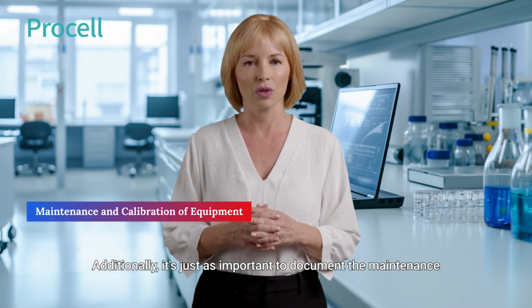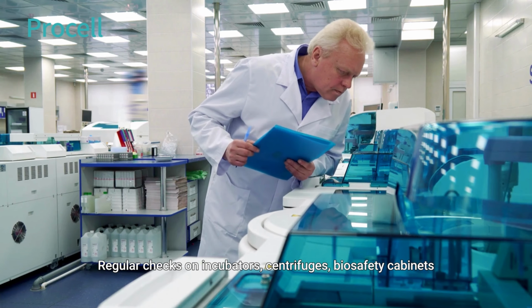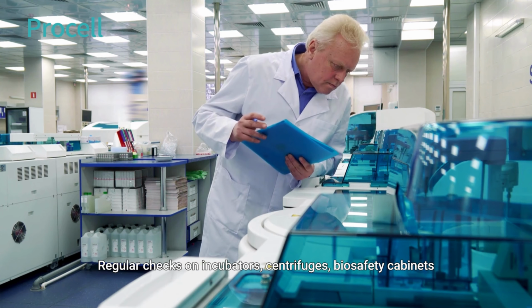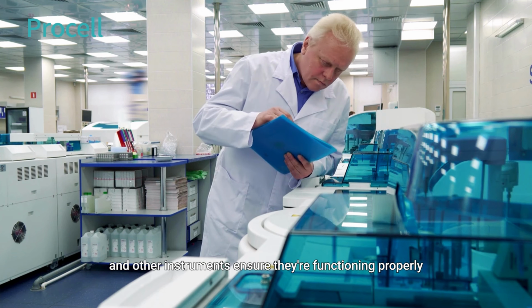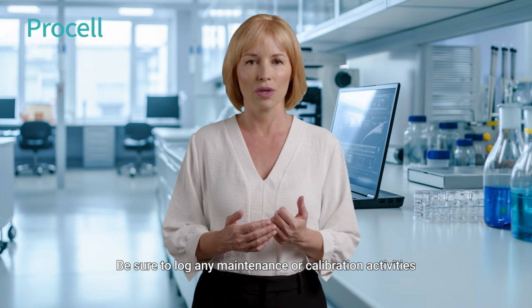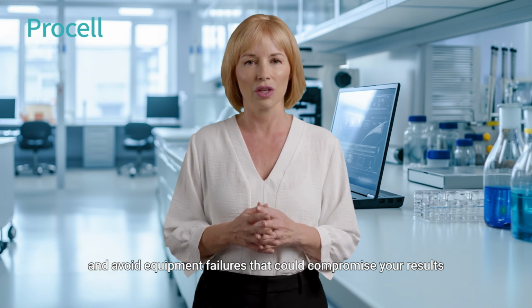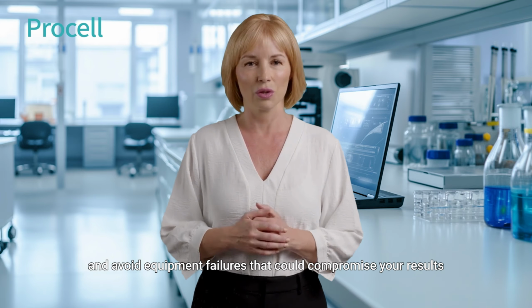Additionally, it's just as important to document the maintenance and calibration of your equipment. Regular checks on incubators, centrifuges, biosafety cabinets, and other instruments ensure they're functioning properly. Be sure to log any maintenance or calibration activities so you can ensure optimal conditions for your cultures and avoid equipment failures that could compromise your results.